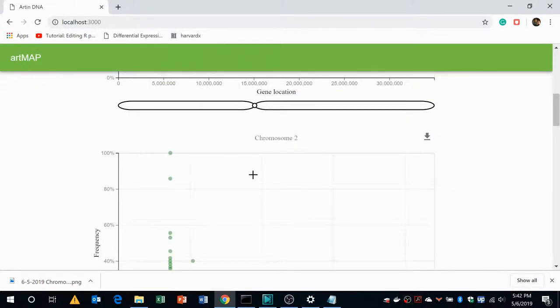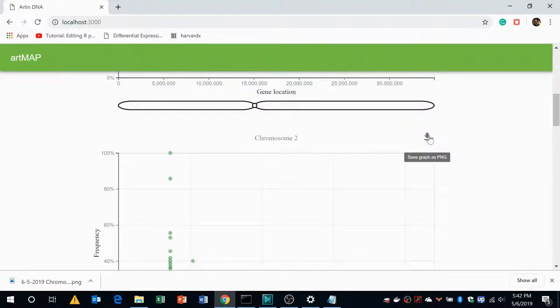Moreover, you can also download the graphs, each of these graphs by clicking on this download button.